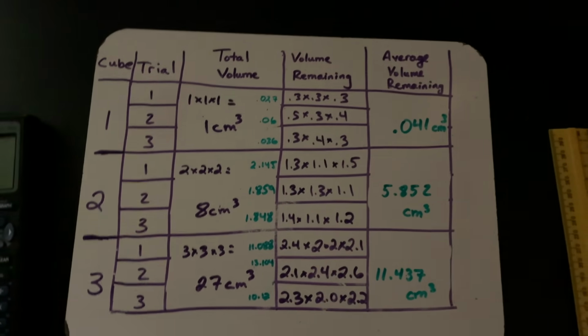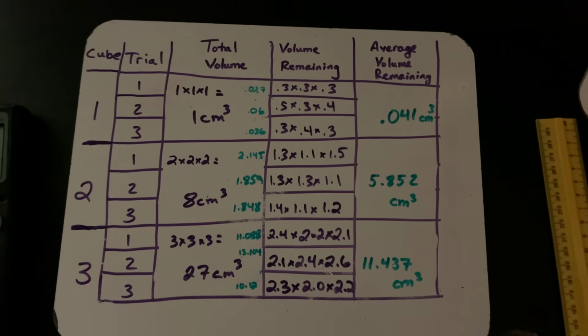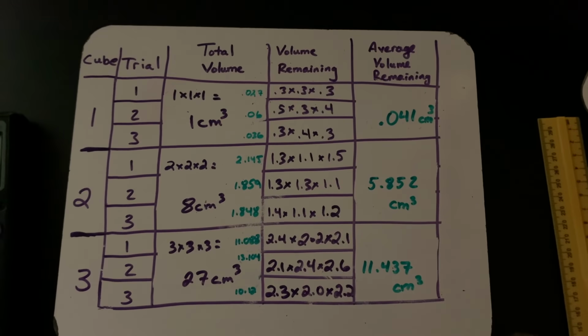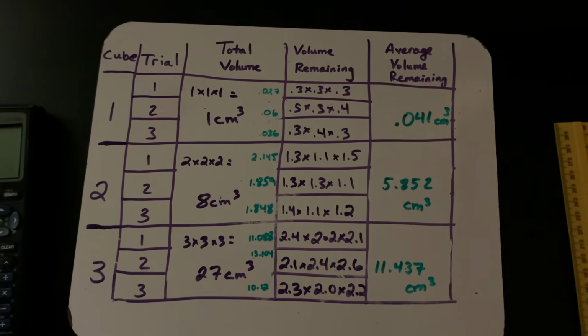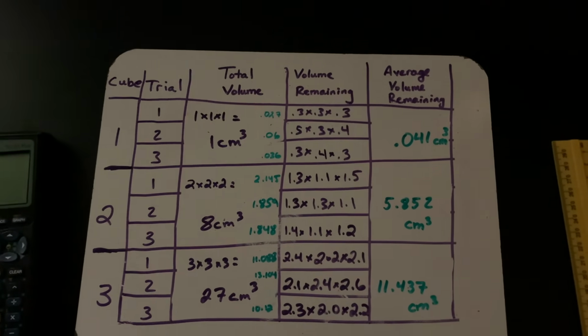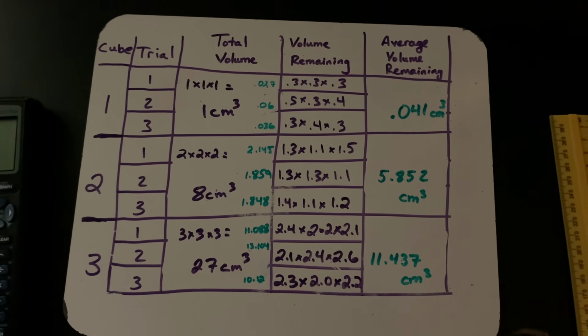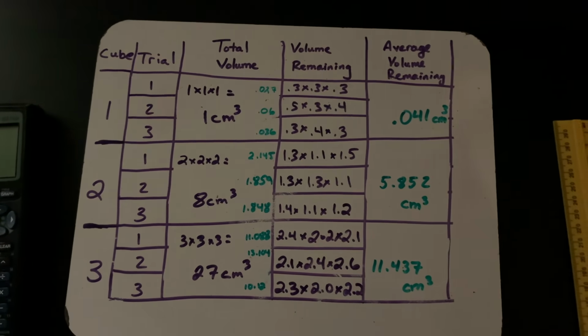Okay, so here's your data table, guys. You can now transfer this information to your other data table in the lab write-up, and this will help you get started. And then you can see if you are going to accept or reject your hypothesis after you get your surface area to volume ratio.